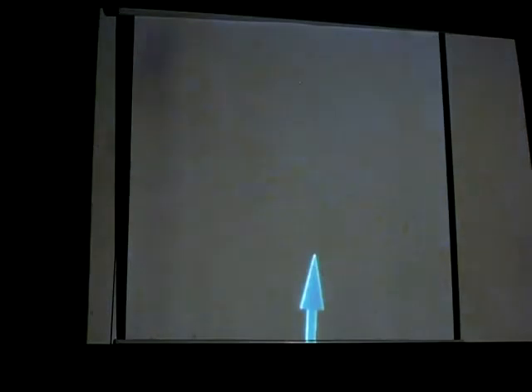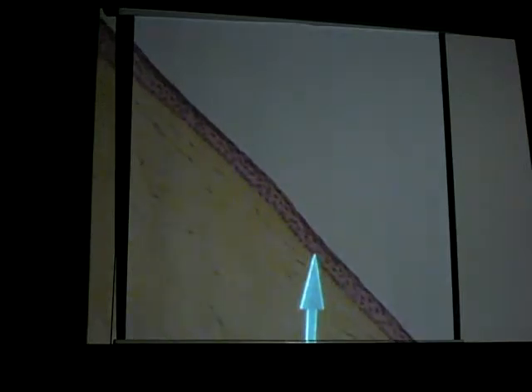So this outer layer here of the eye, that's your sclera. Alright, so all this connective tissue here. So that happens right about here, about at the point of the iris. Alright, but a good way to see the transition is to just follow the epithelium of the cornea here. And then where it starts to get thicker, that's your transitional region here. That's your limbus.